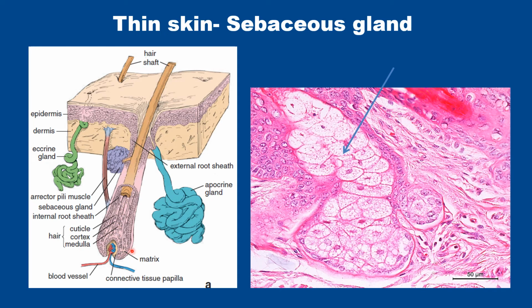The melanocytes are present at the matrix; they divide and migrate into this layer. With aging, the number of melanocytes decreases and the number of melanosomes also decreases. That makes the color of the hair gray in old subjects. The melanocytes are absent or fewer in the matrix of the hair follicle, so that is the cause of graying of the hair, and it may happen because of other reasons also. If people become very stressed, the melanocyte also stops secretion of melanosomes, and that is the cause of premature graying of hair. Now come to the sebaceous gland.